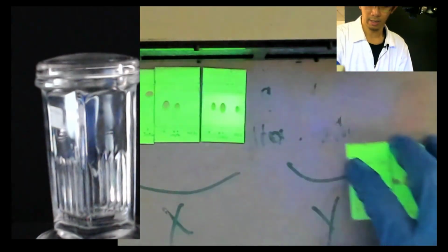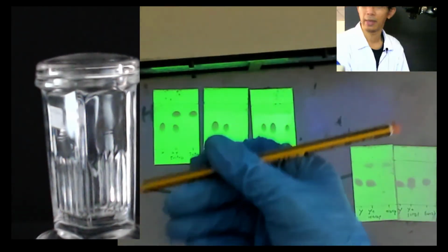Zoom, you cannot see. You can see, yeah, you can see. Oh, let's do one by one. This put here, this one here. Much clearer. This is X. So now I will trace this thing using pencil.